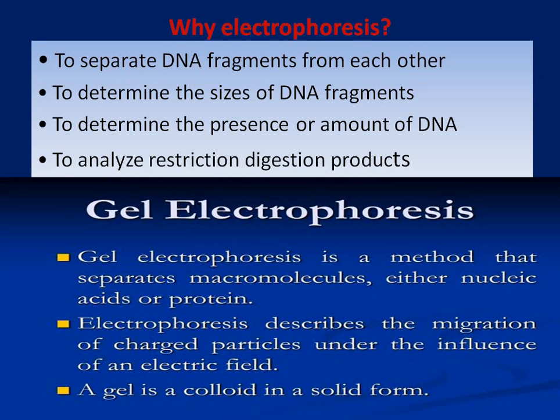Electrophoresis also describes the migration of charged particles under the influence of an electric field. Again, another thing is that a gel is a colloid in a solid form.